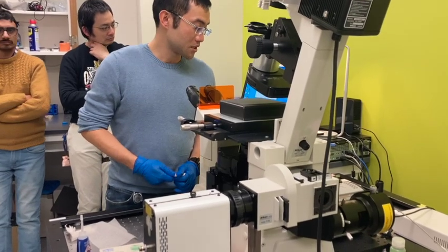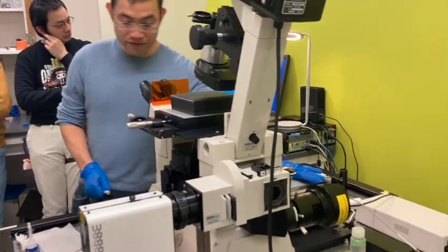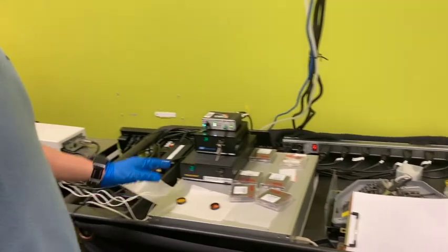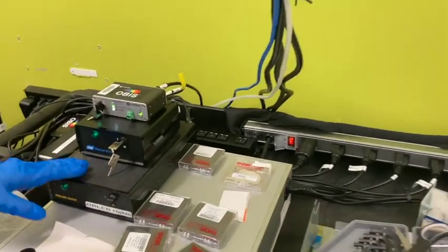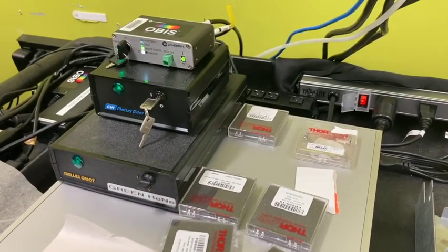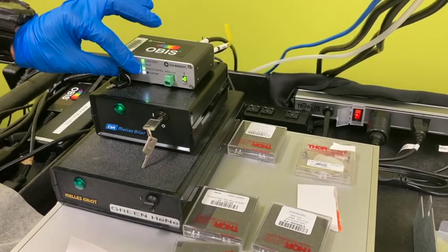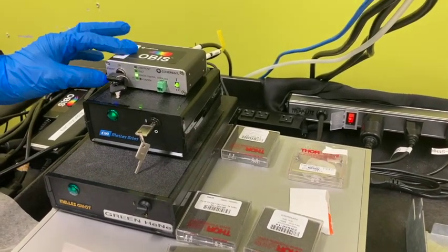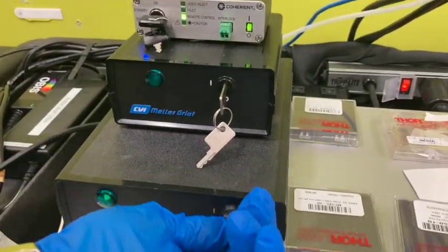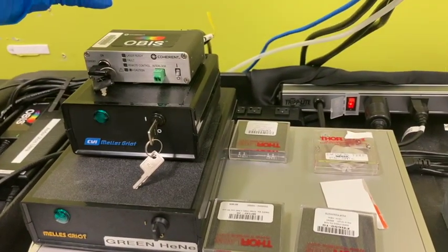Now we make sure this is turned off, and then we have the main power here. Actually, we still have our laser on. We just turned the shutter off, so we don't have laser going through our objective. The blue laser switches to standby, and the red one we just turn off. It's already off, and you can turn this off, and then the main power.